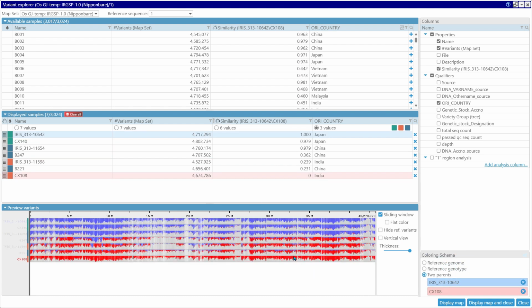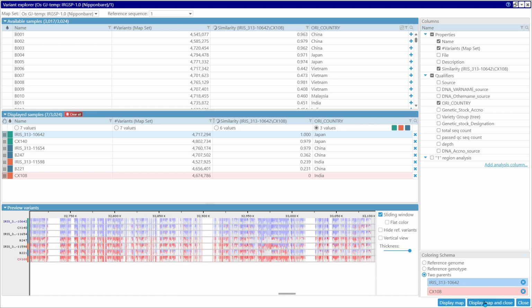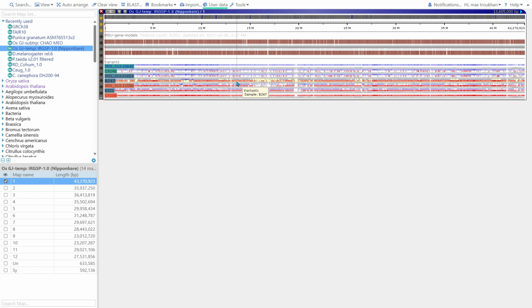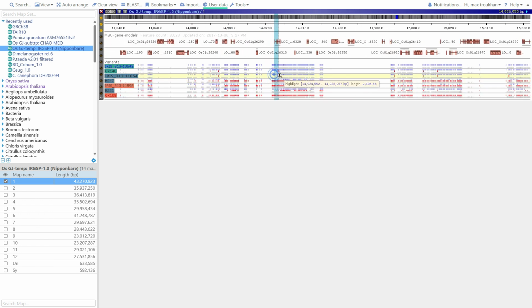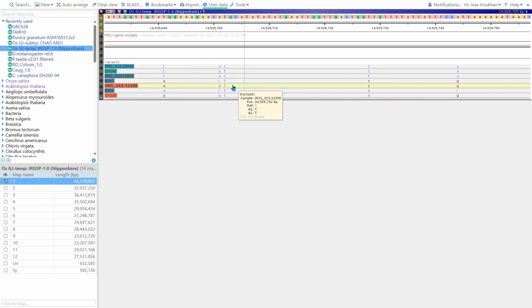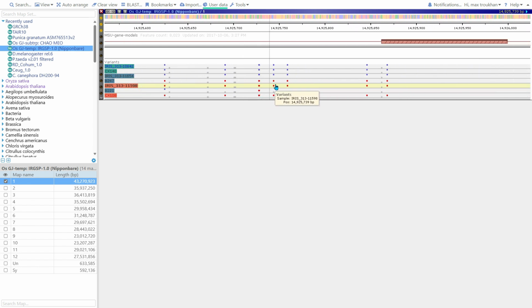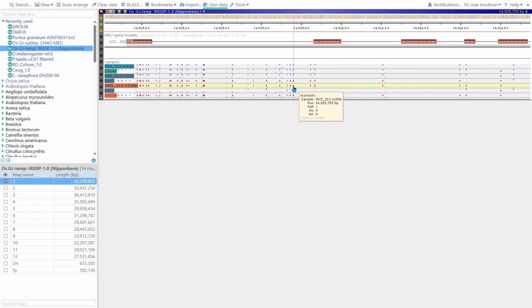The preview can be zoomed in to a certain level, but to examine individual bases, we will open the map with the new track added and adjust the scale to the nucleotide level. If we're interested in allelic distribution around a particular gene, we can zoom in until individual variants are visible. At this scale, the local variants form can be accessed by clicking on one of the variants.